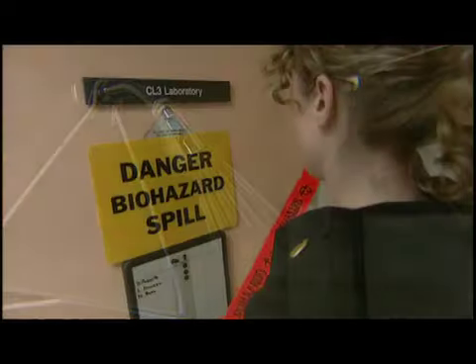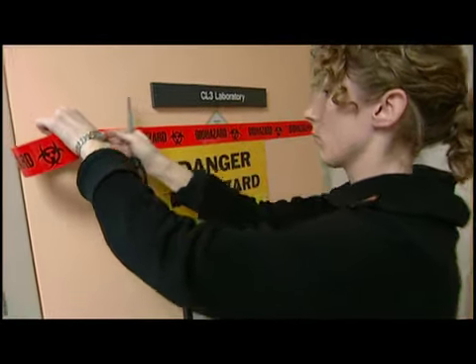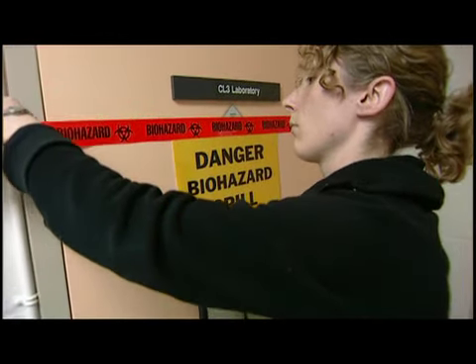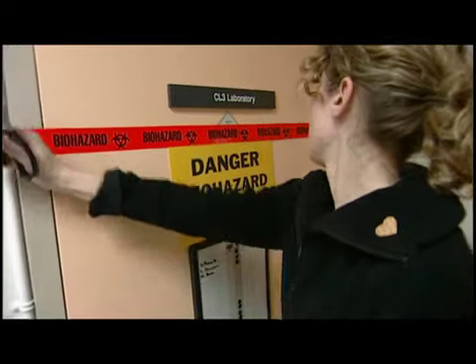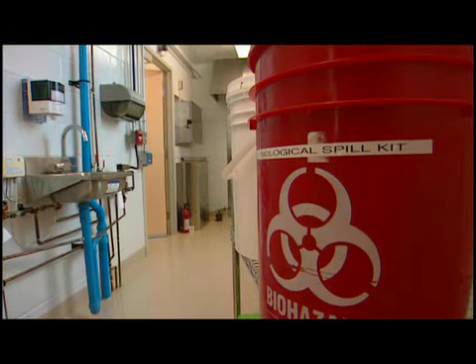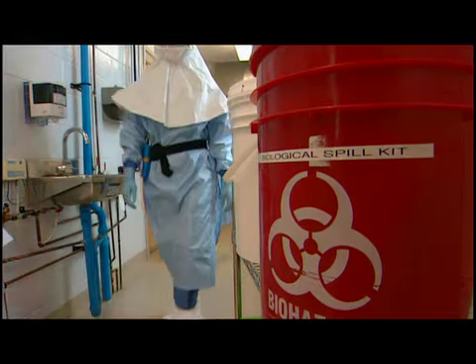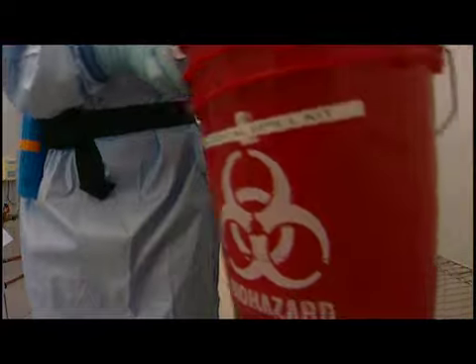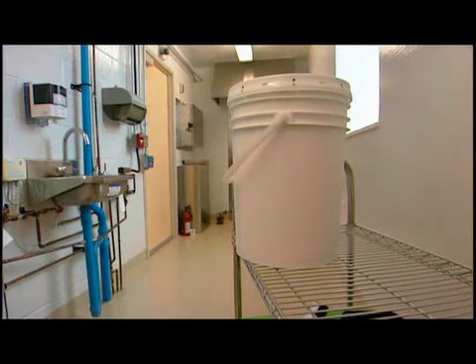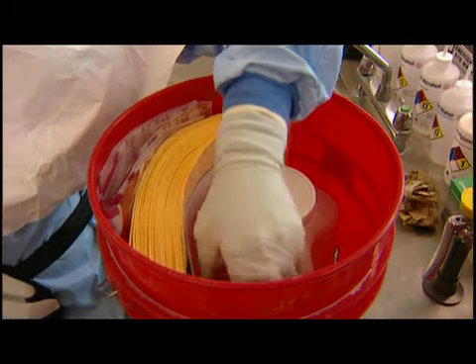Make sure nobody enters the facility for the time indicated in your SOPs to allow the aerosols to settle and the air to be exchanged a sufficient number of times. Re-enter the lab following entry procedures and proceed with the cleanup. Your facility's SOP may require that you wear a powered air purifying respirator or other additional personal protective equipment for spill cleanup. If a liquid was spilled, apply fluid control solidifier.